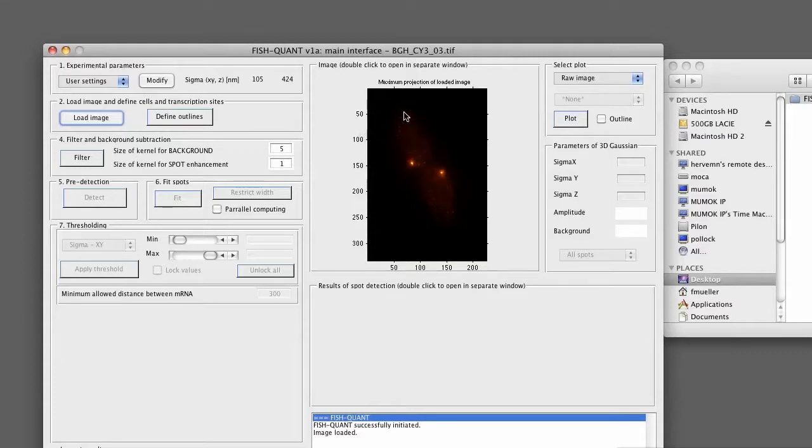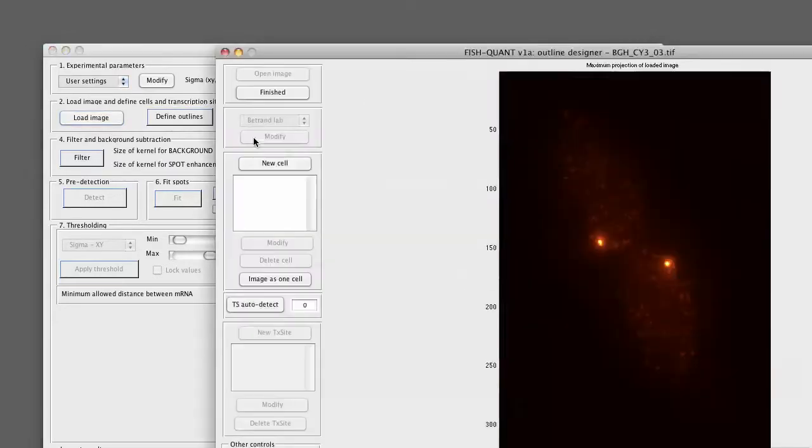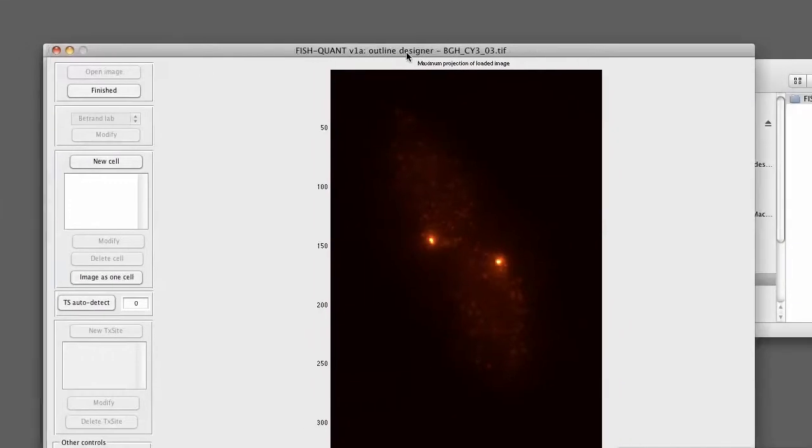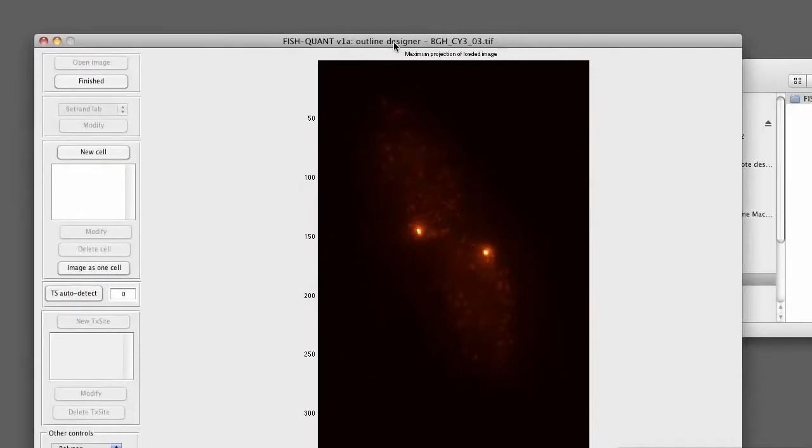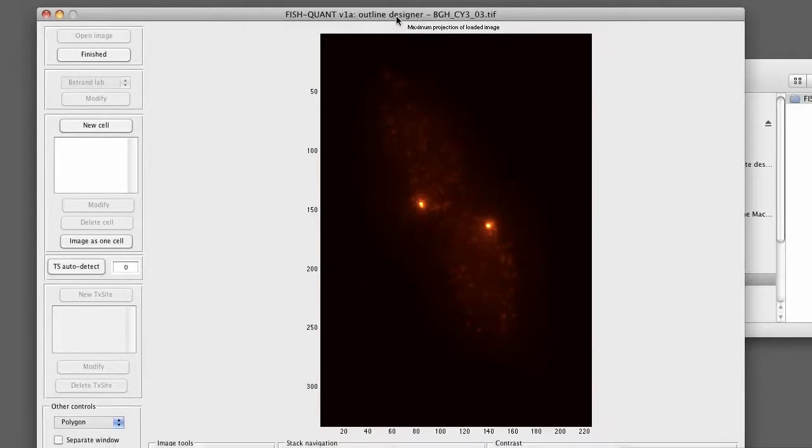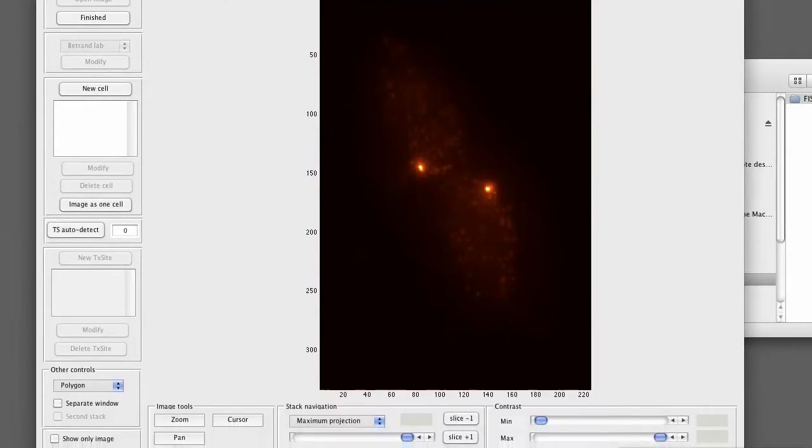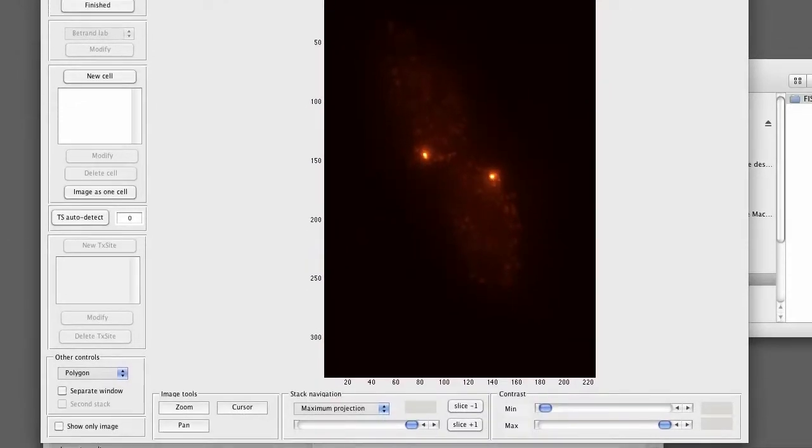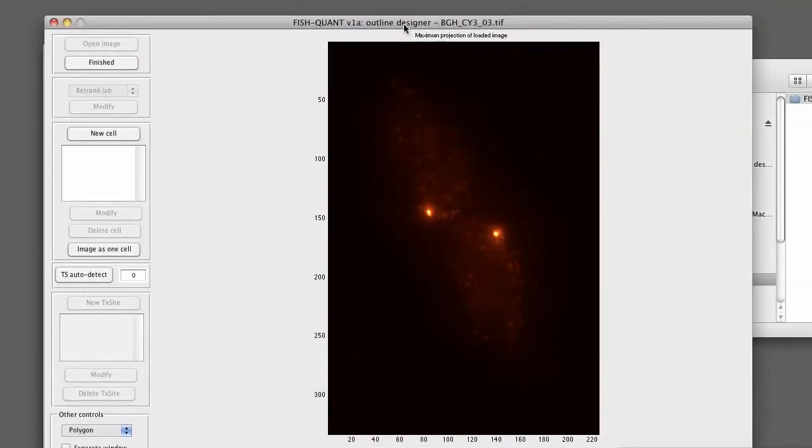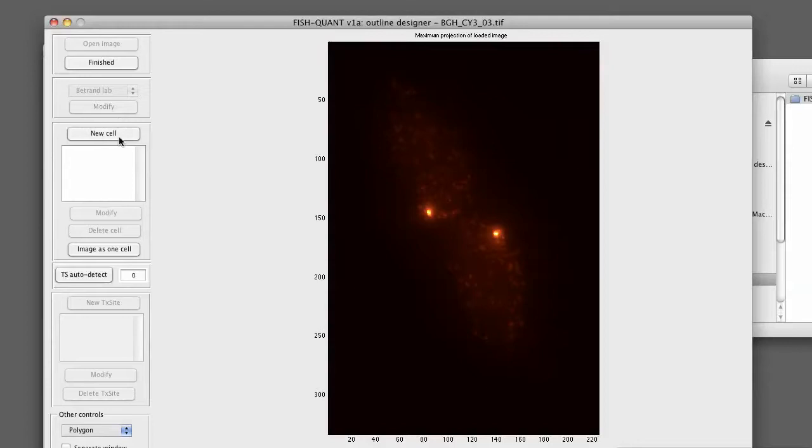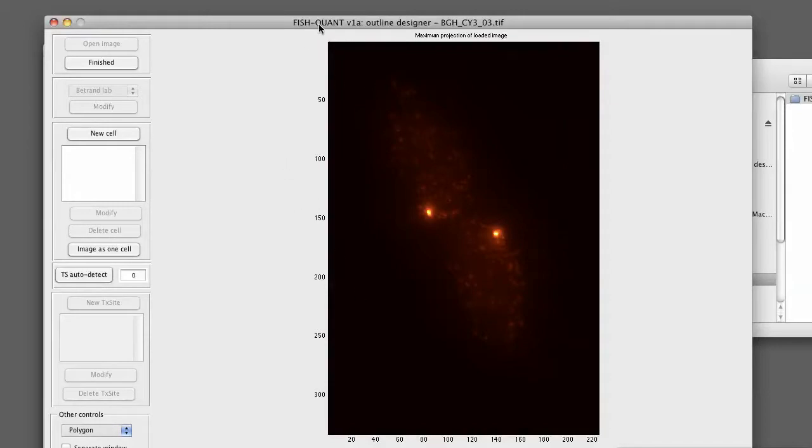In order to define the outlines now, we press on the define outlines button. This will open another interface. Unfortunately, it's a little bit too big for this screen capture, but I will just explain it in full detail now. So here we have a button finished that we press as soon as we're done with the outline definition. Here we define the new cells. Each time we press on new cell, we can define a new cell. It will be listed in the box. We can modify the geometry or we can simply delete cells. We can also define the entire image as one cell if you want to.